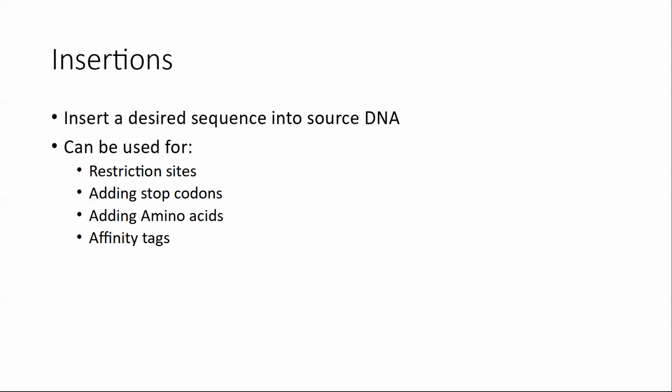So what I was saying is, it could be used for inserting restriction sites either at the beginning or end of a gene, so that we can use a bacterial vector to amplify the DNA, which is much more efficient than using PCR.